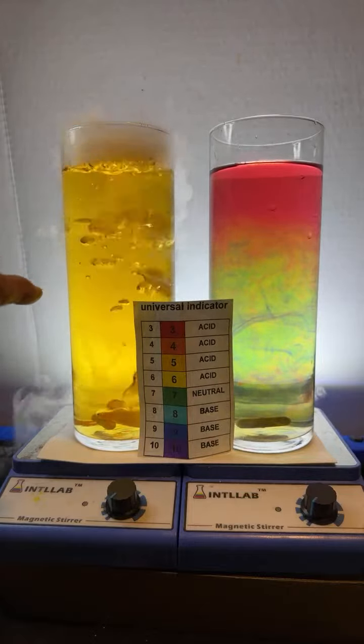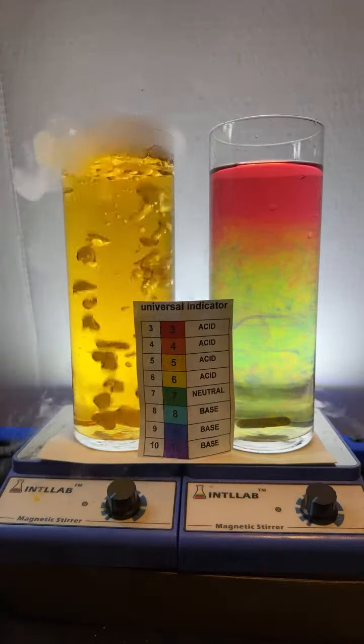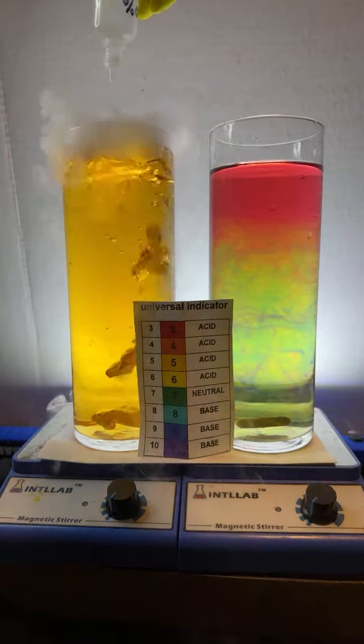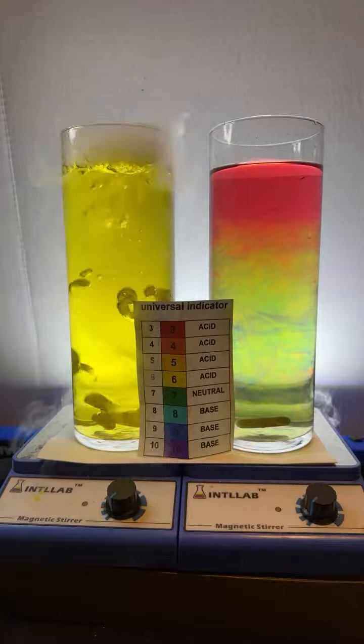No, it won't quite get to pH 3, but if you look up here at the top, you can see some of it's like a 6 or 5. All right, here we go. I'm going to add a bunch of base over here. So in it goes. And the carbon dioxide is just totally consuming the base that I add.